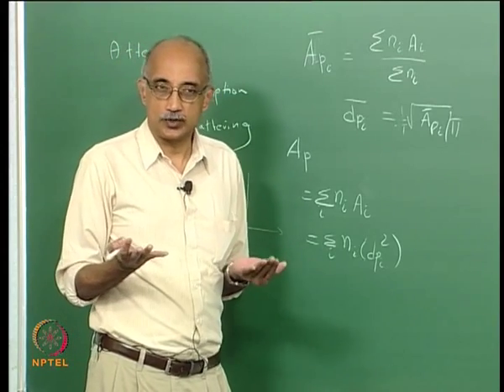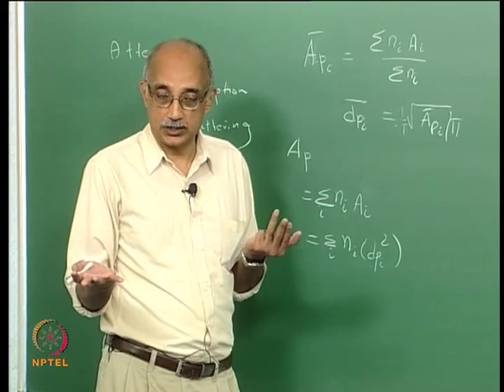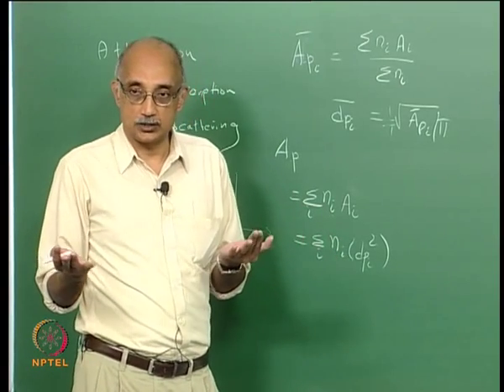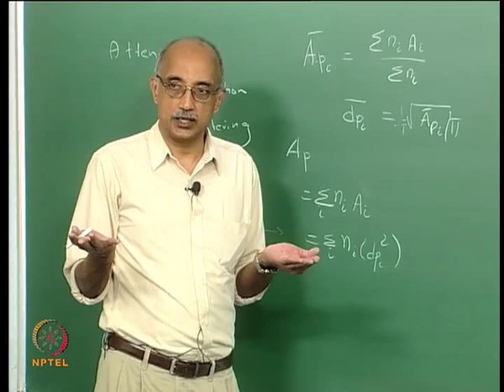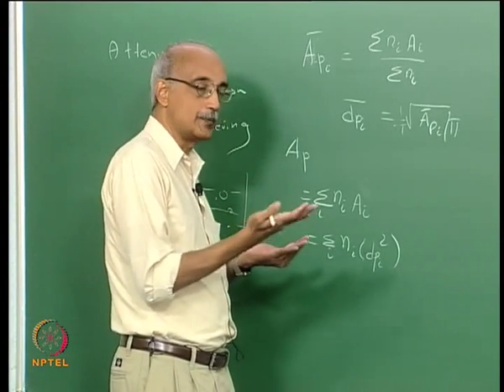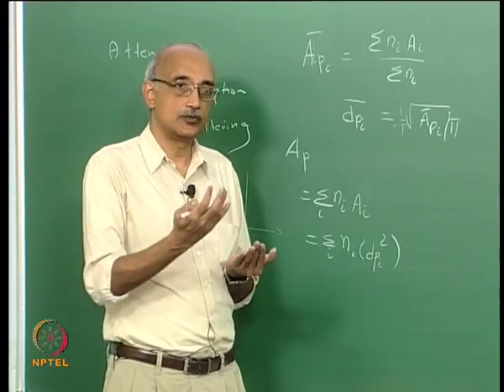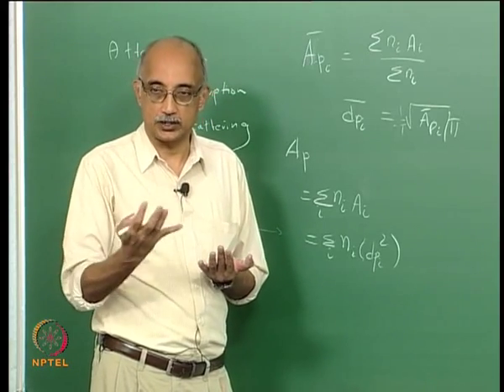What can you conclude from that? Can you conclude that this solution has twice the concentration as this one, or can you conclude that the particle scattering cross section is twice as much in this as this? You do not know, because it is really a combination of the two. So when you have two samples in which both the concentration as well as size distribution are changing, it is very difficult to deconvolute the two effects on total scattering intensity.